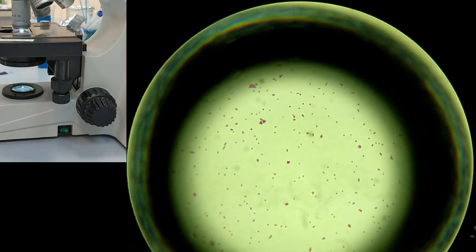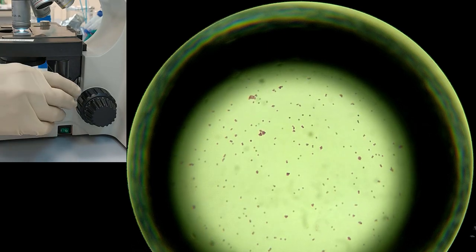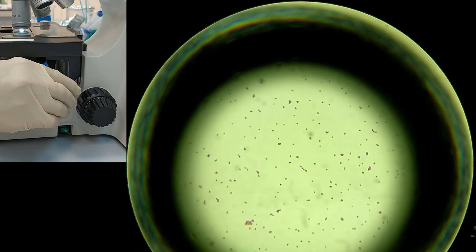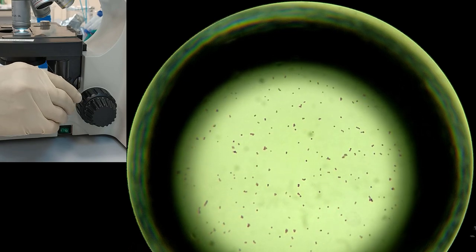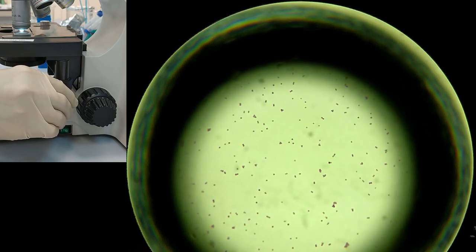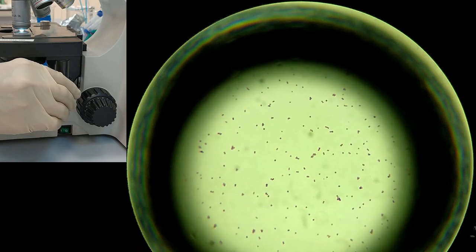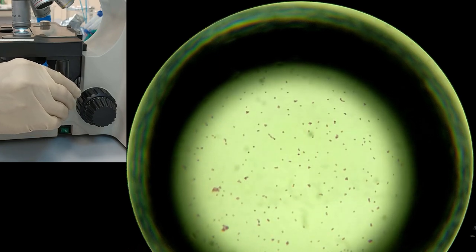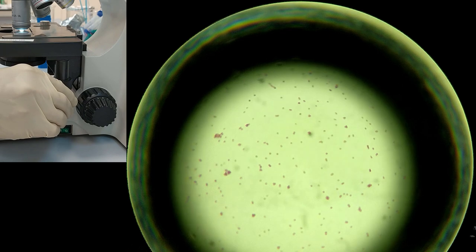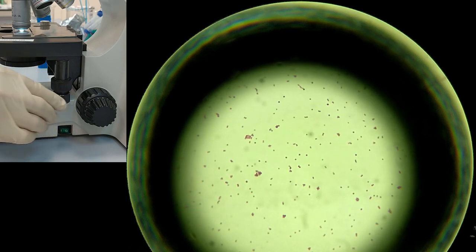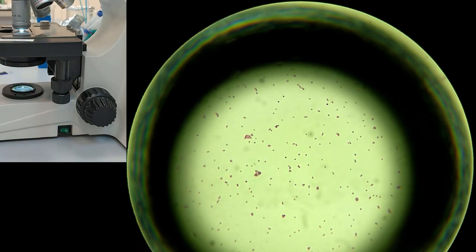When we focused, we can use the stage controls to find the best view for ourselves, and then try to draw these cells in your notebook. Now they are stained purple, and this means that they are gram-positive cells.